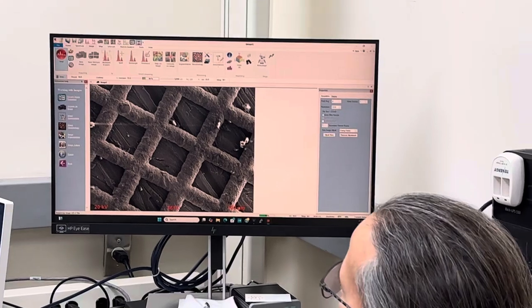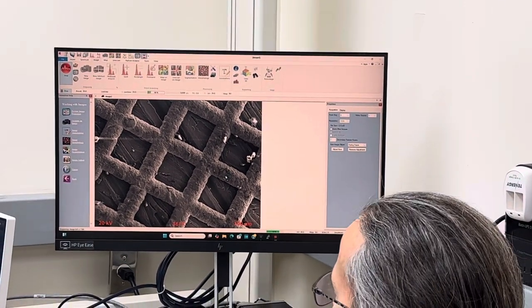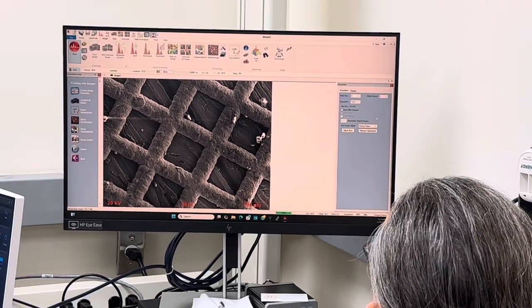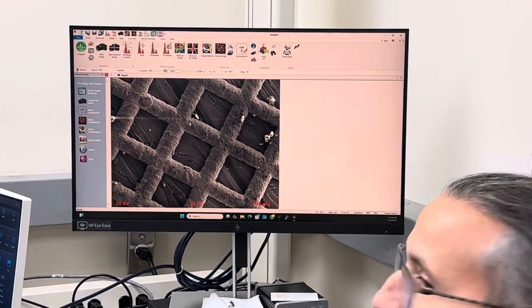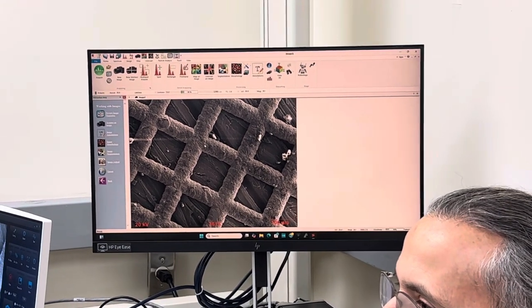I was seeing some noise here, so I just wanted to get rid of it. So I just changed some parameters. Ignore what I did. You won't have to do that. That's the default now, so it's great. All right. Anyway, I see when you acquire the image there, the image is kind of built, very noisy.